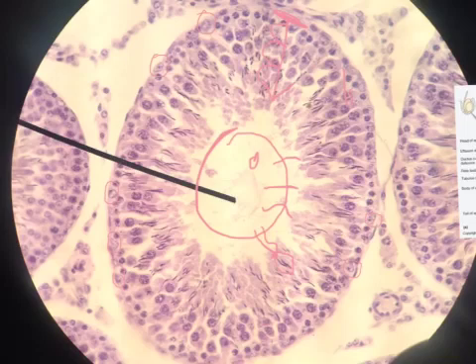And then the one other thing that you can see in this slide is these interstitial areas, the areas that are between each seminiferous tubule. These cells are called interstitial cells of Leydig. But I like to just call them interstitial cells because that tells you exactly where they are. And their function is to secrete testosterone. So here's where the testosterone comes from. Spermatogenesis is within the seminiferous tubules. Between the seminiferous tubules is where the testosterone is coming.